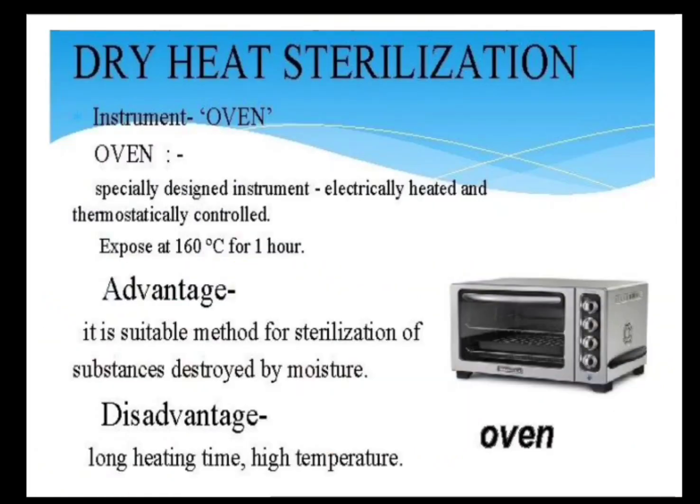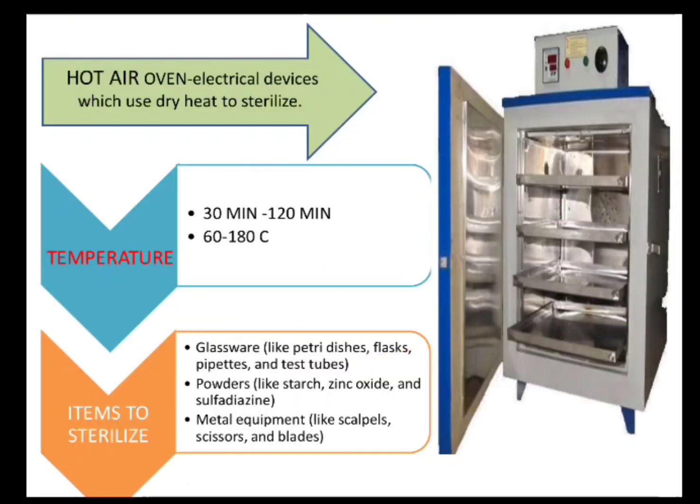It's a modified form of your oven, which you have in your hot air oven. It is an instrument which is an insulated double walled chamber. You can see it is a double walled chamber, okay, and it is insulated, inside which there is a circulating fan. There are racks kept. Why are these racks? So that you can keep your materials for sterilization.